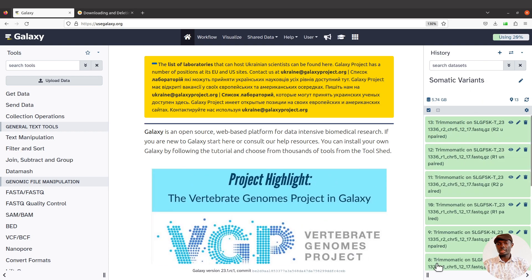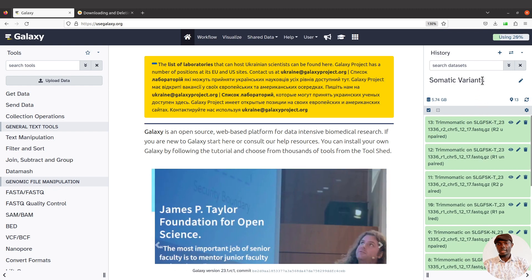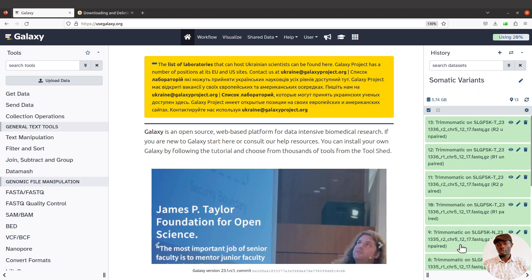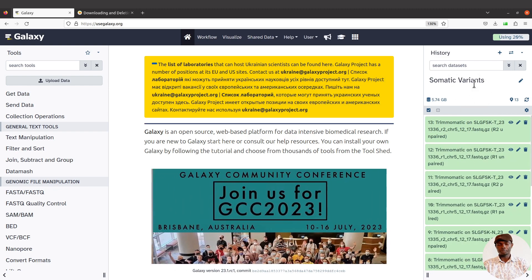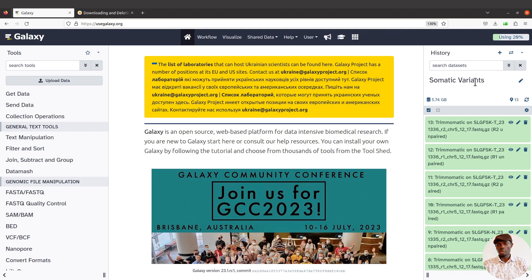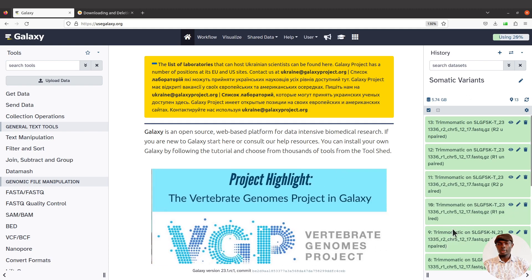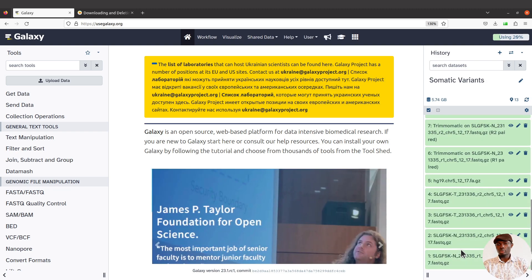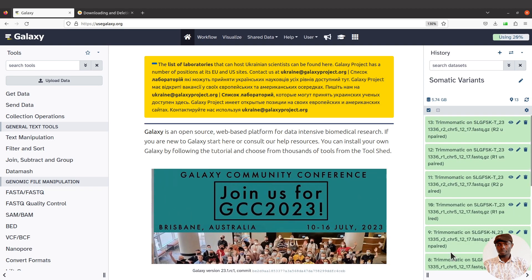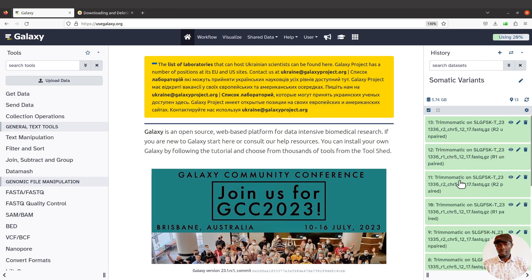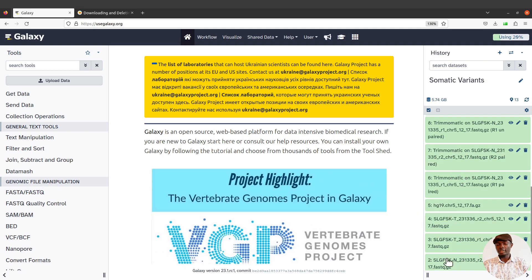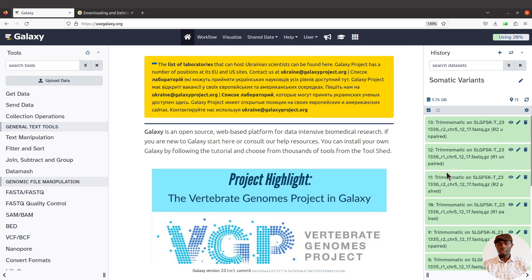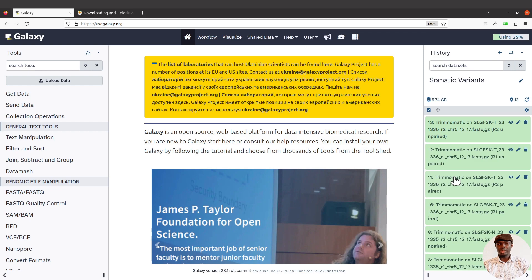I'm going to demonstrate using this activity here — a somatic variance activity I performed. By the way, this tutorial is available in the command line version, so you can check the description for that video. I have some files generated here that I would like to remove: the passcode files, the raw reads, and the trimmed reads.